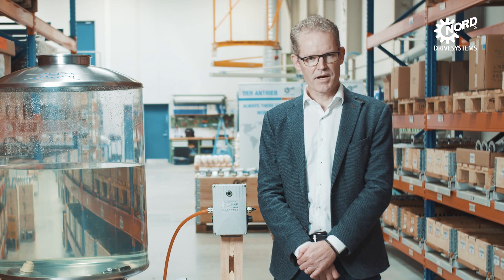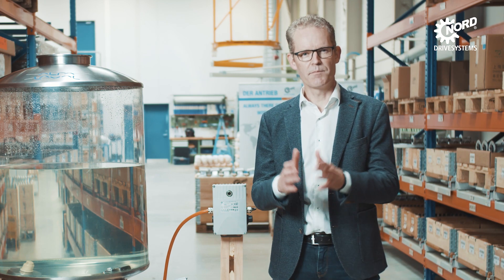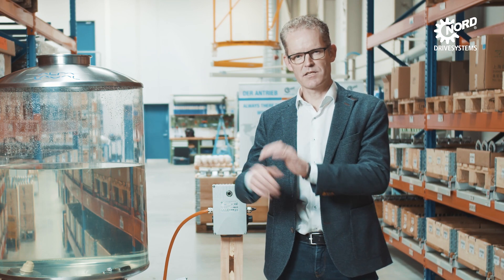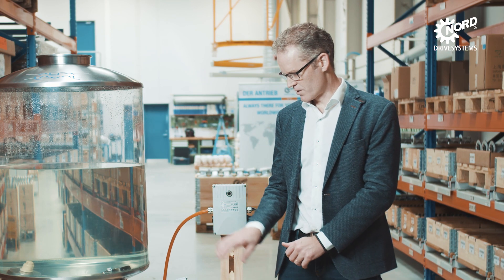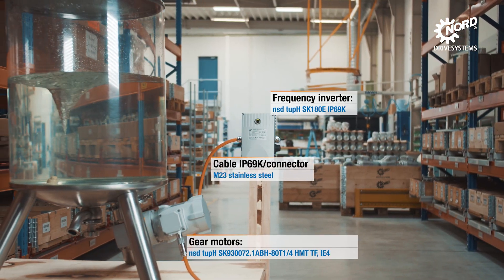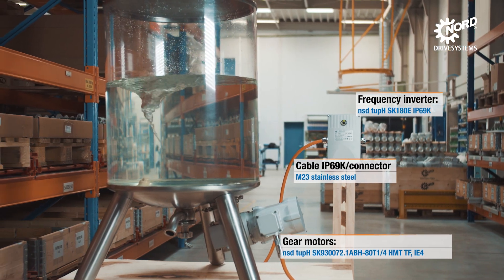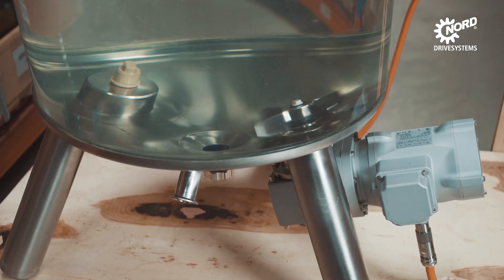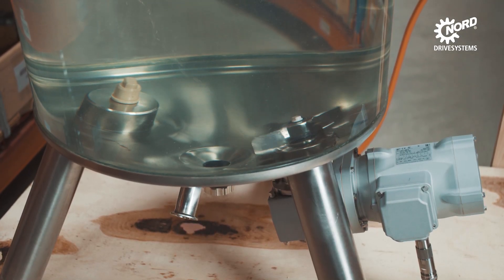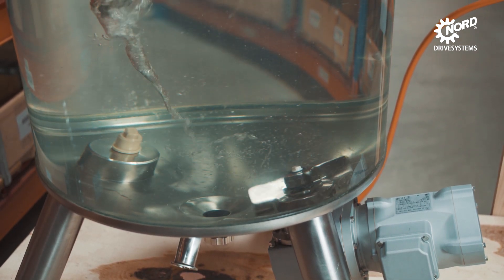The Alfa Laval Levimag is a levitated magnetic mixer, consisting of a drive unit, a motor, and inside a tank there is an impeller or a wing — a rotating device — that is used to mix certain liquids inside a vessel like this one.